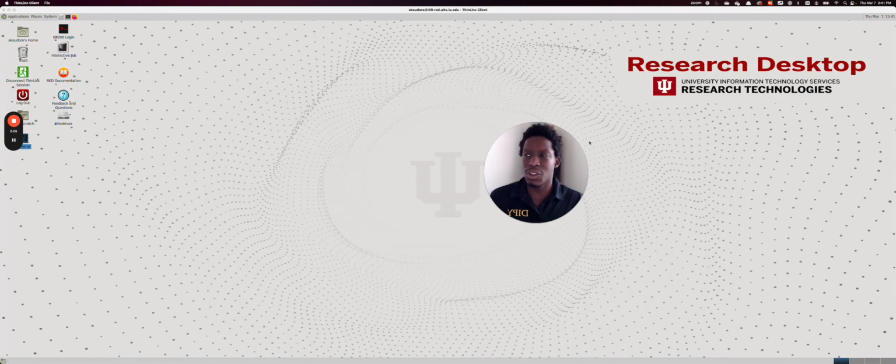The goal of this video is to install DIPY in a Linux system. So as you can see, I'm connected to a Linux environment. Here it's a research desktop of IU, but it can work on any Linux system.